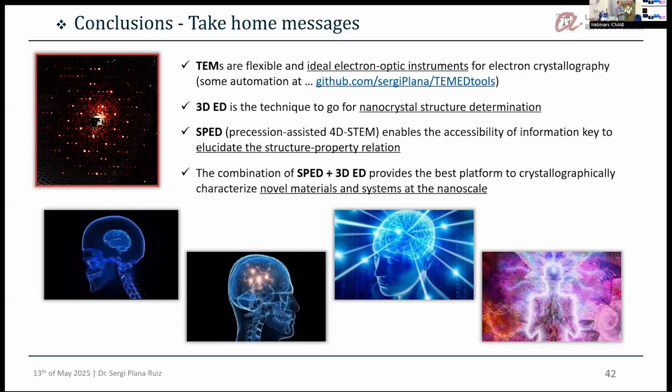Correct. Okay, thank you. Regarding the dose and possible damage, there are also these new electrostatic blankers that allow you to control the dose on your sample. These are quite neat. They are not in every microscope, but in a few years there will be.